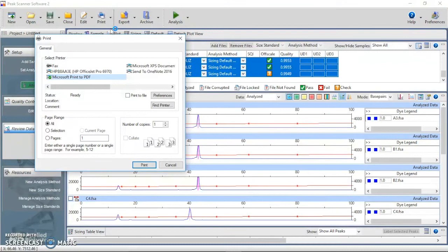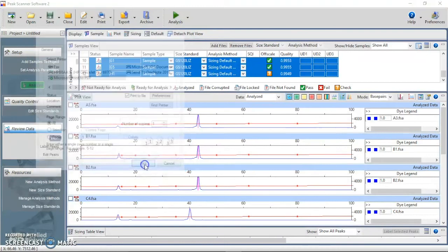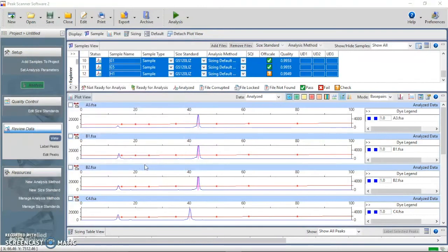Now you can print out the plots. I choose Print to File, just for demo purpose. You can print to the printer directly.